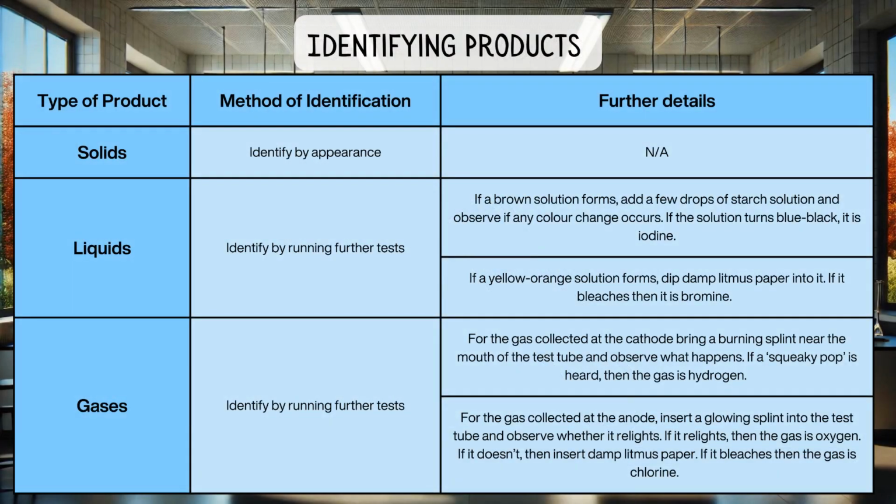All of these tests used to identify the products formed during this experiment are summarized in this table.